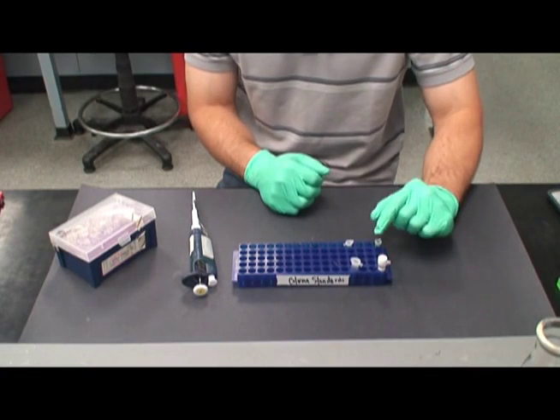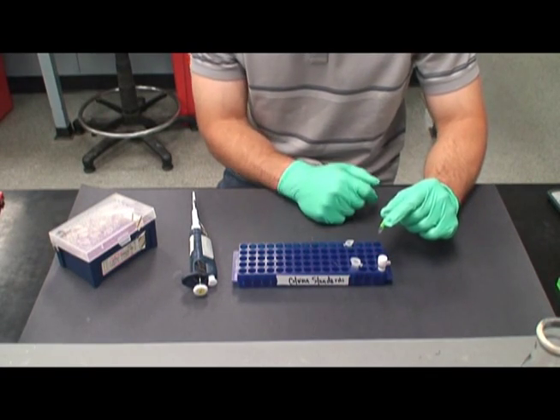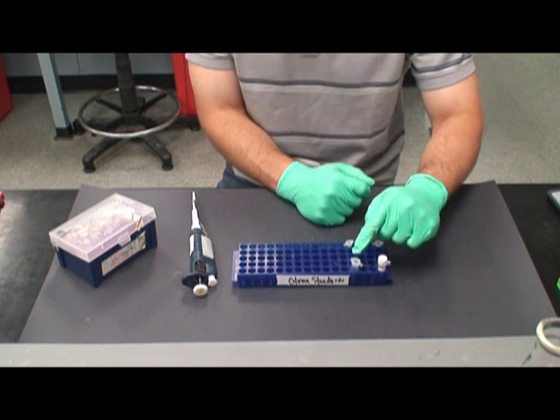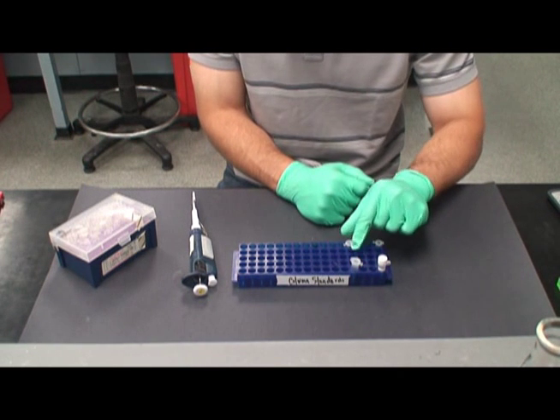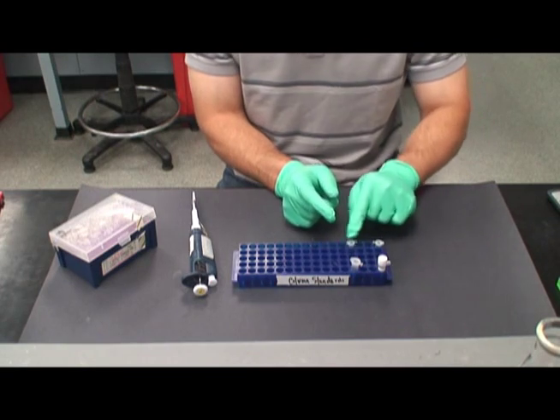Now, 2 microliters of the Hindi 3 will be added only to the Hindi 3 tube, while 2 microliters of water will be added to the undigested tube to keep the volumes equal.